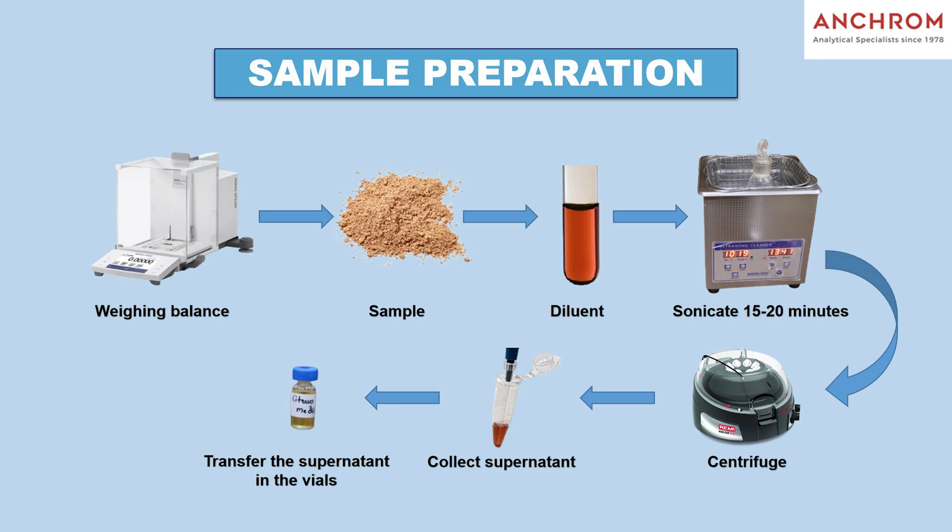First, weigh the sample accurately. Second, add the appropriate diluent to the sample. Third, vortex the mixture to ensure thorough mixing. Fourth, sonicate the mixture for optimal dissolution. Fifth, finally centrifuge the mixture and use the supernatant for application.